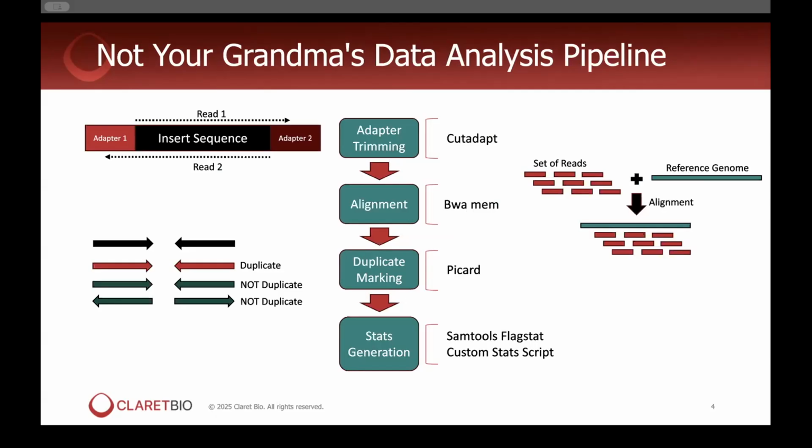And so if you try to map these sequences or align these sequences while they contained the adapter sequences, you'd have a lot of trouble and your mapping scores would be quite poor. So because of that, we do adapter trimming, which searches for the portions of the adapter sequence in the reads and removes them. And this allows, for downstream use, you're able to map much better.